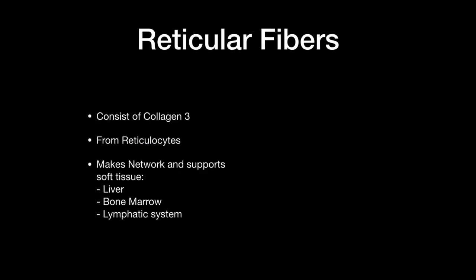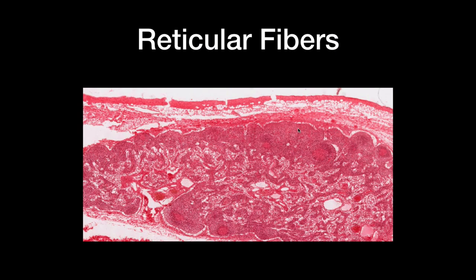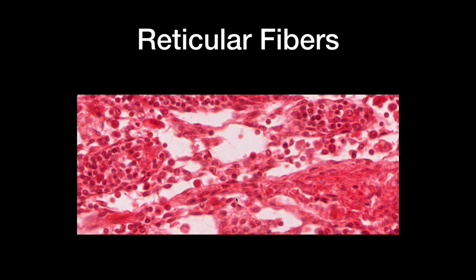Reticular fibers are mainly type 3 collagen and are made by reticulocytes, which form a network supporting soft tissues such as the liver, bone marrow, and lymphatic system. Looking at a cross-section of the lymph nodes, to find reticular fibers it's easier to zoom into the lighter areas. And zooming in, the slide looks quite dense and complex.